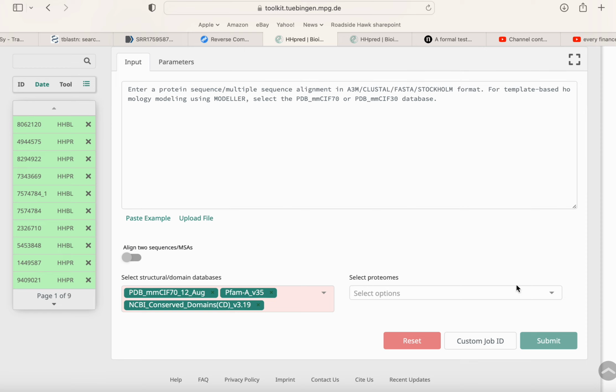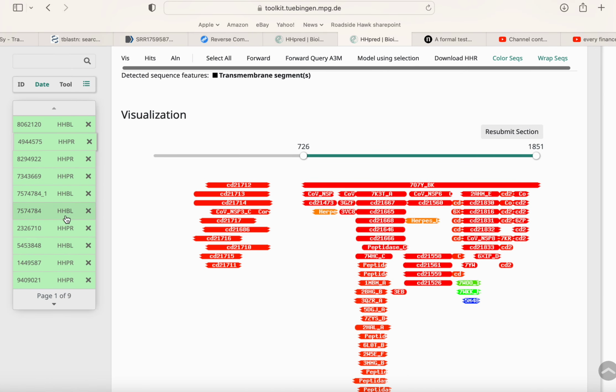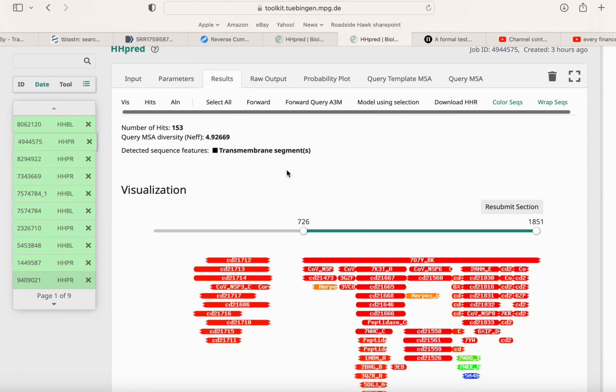So you paste your protein in there, or your protein multiple sequence alignment with all of them in Pearson FASTA format. And it will check either your alignment or your individual sequence. So bam, hit submit. So let's go to our actual results. Oh, and this is a list over on the side of all your recent searches. And so this is the one I'm actually on. And so clicking that would bring us back to this page.